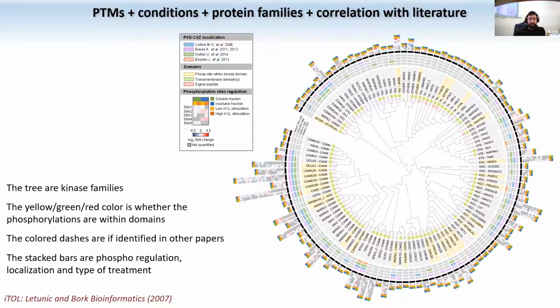You're going to get these slides so you can get some inspiration from some of your data representation if you are interested. I always wrote in the bottom here what kind of software is used to generate a graph like this. Most of this software has a graphic user interface, so it's enough that you paste your table in the exact format, and then it makes graphs for you.